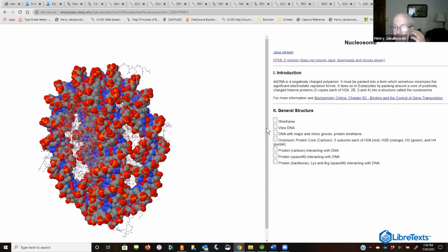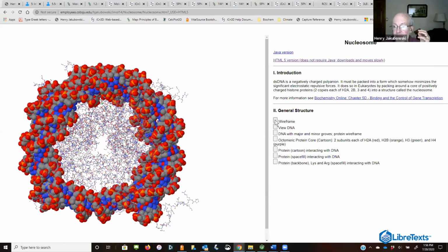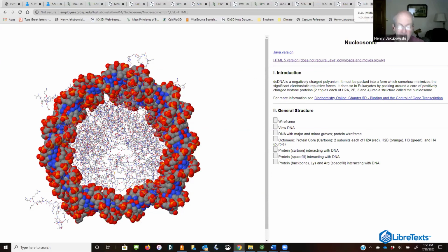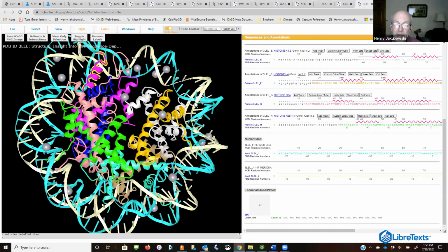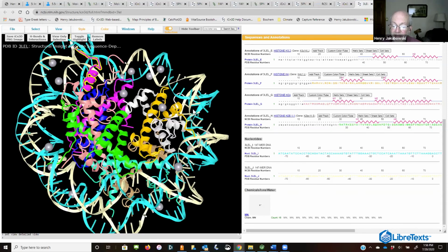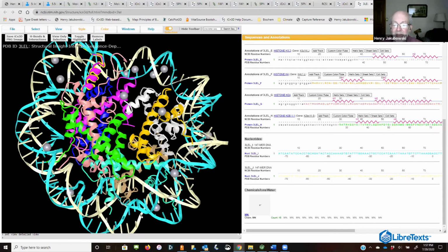Yeah, exactly. Is there an analogous thing that you can do with the iCn3D? There is not, and that's useful. I think it's great to have some of these, and you can't do it with iCn3D. At the same time, I think it's important for the students to learn how to do it on their own. So it's a pedagogical and philosophical question, because this is really kind of a passive approach.